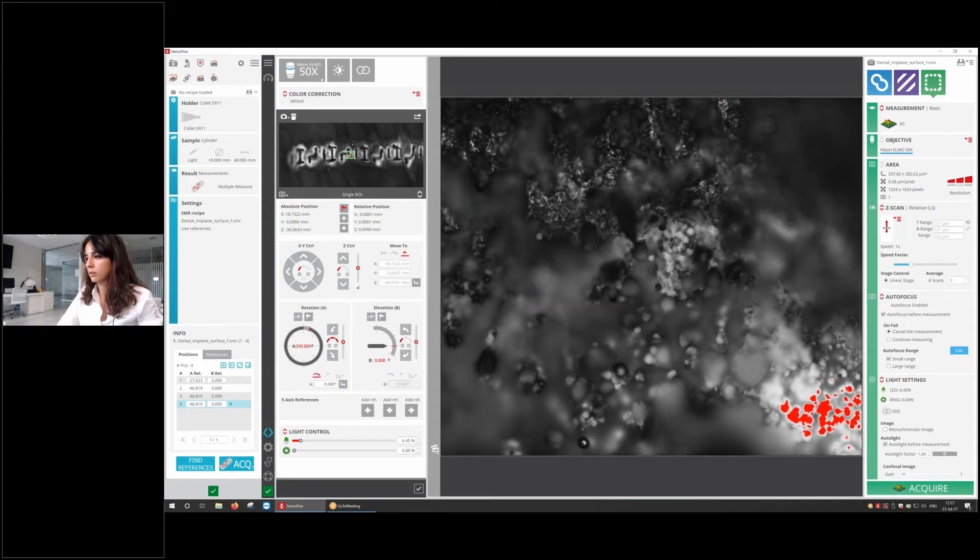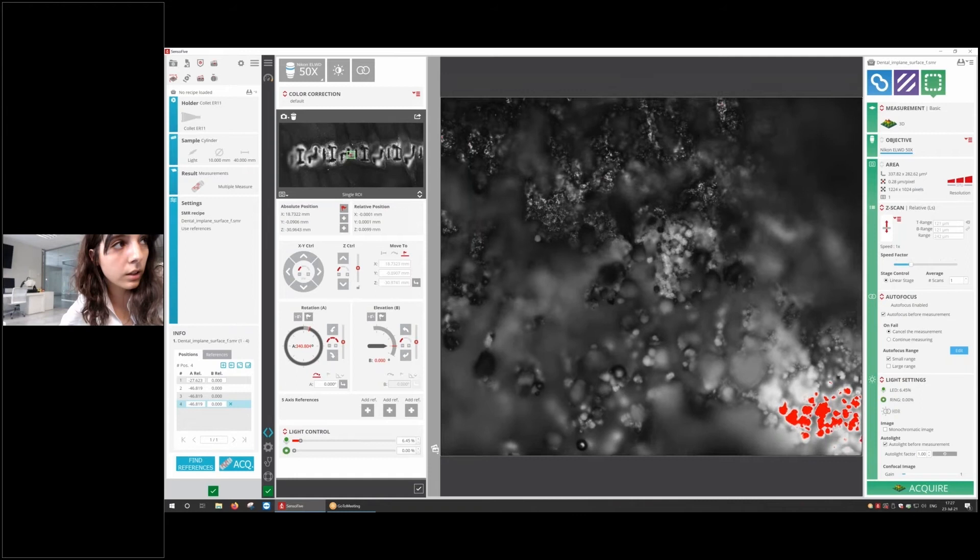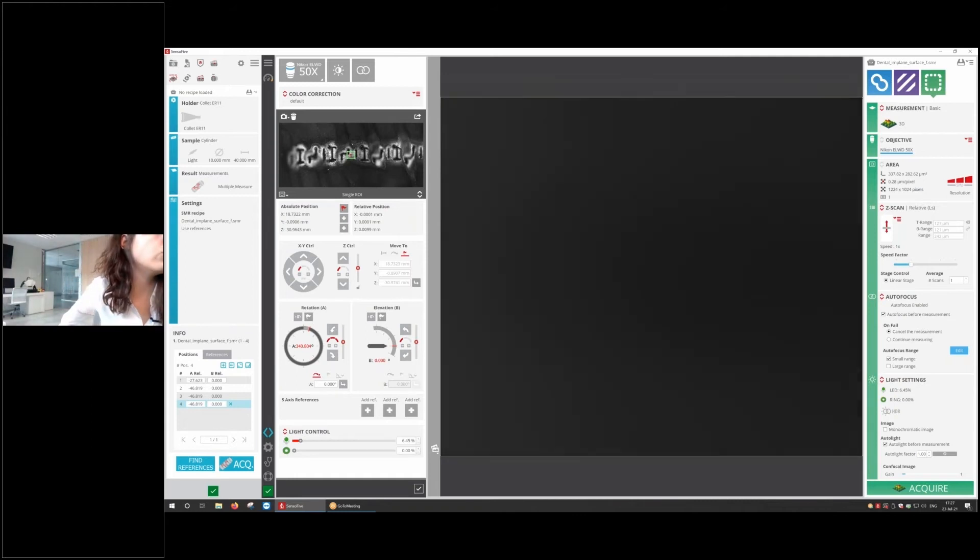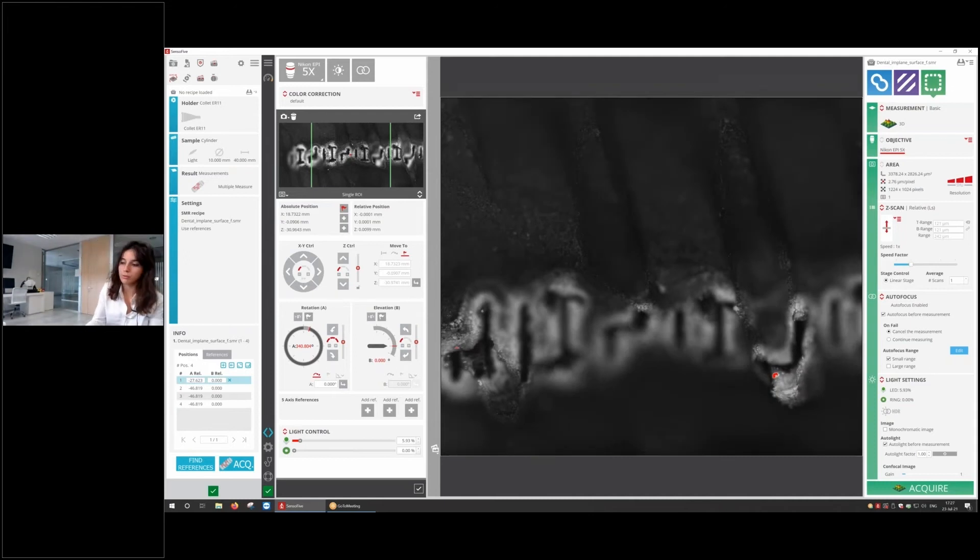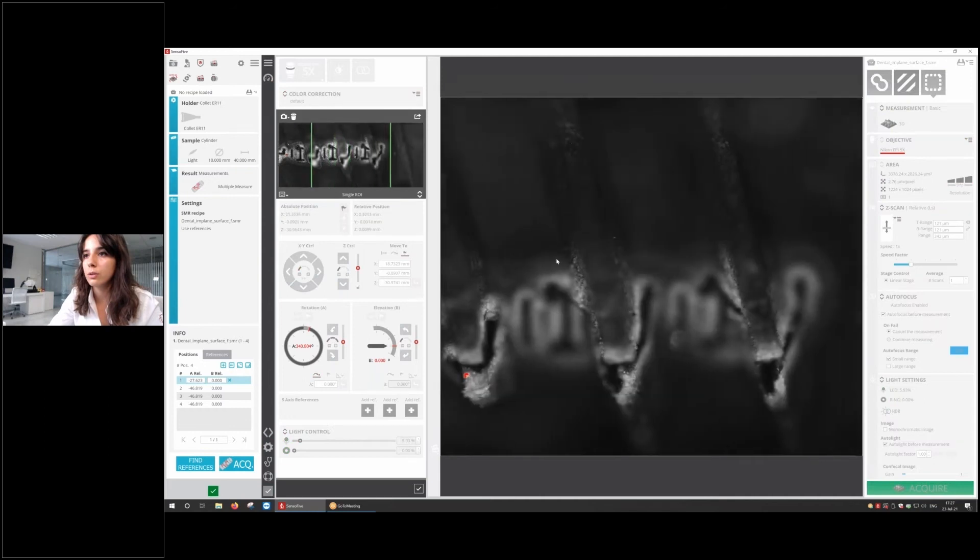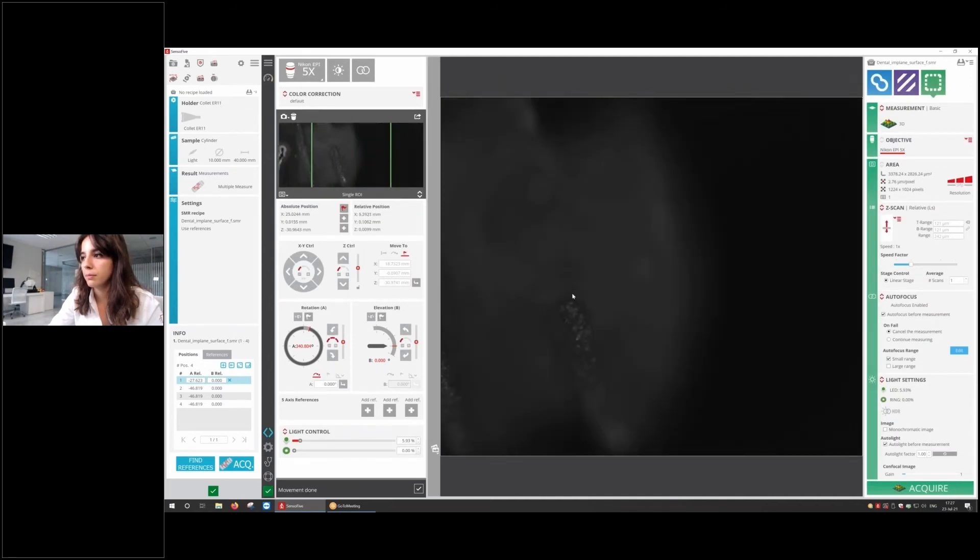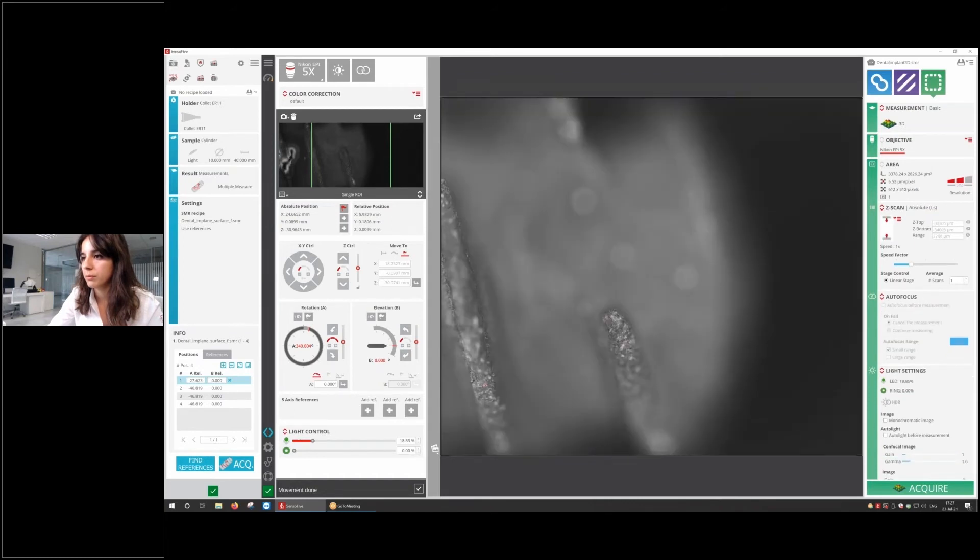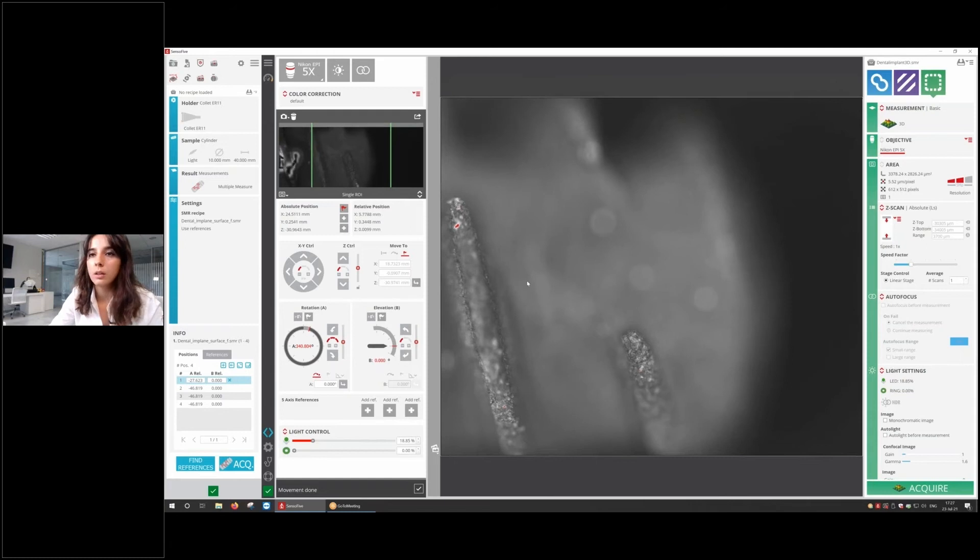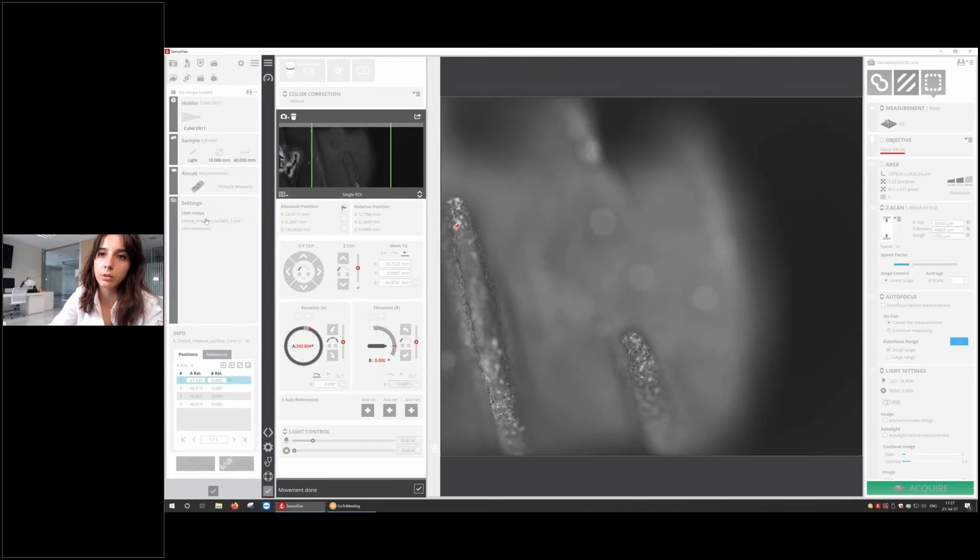Let's do a new acquisition. But this time, we're going to do a full preview of the dental implants, something that normally we also check in this kind of sample. We're going to change to the 5x. I'm going to go to the tip of the dental implant. I'm going to load the recipe that I established earlier. The thing is, we're going to change the type of measurements that we're going to do. Let's do a circle.